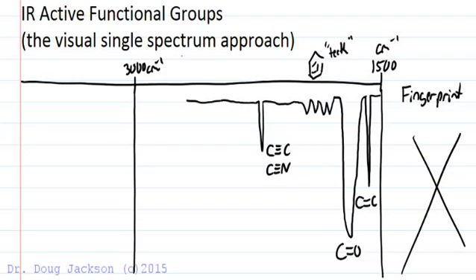The next thing we might see is to the right of 3000, we might see signals, looks kind of like a dog's ear, like a hound dog, but these are SP3 CH stretches. So the CH bonds stretching in and out. All of these are stretches that we've looked at so far other than the overtones. So they're all stretching in and out and giving us this signal. Sometimes these are smaller or larger than other signals.